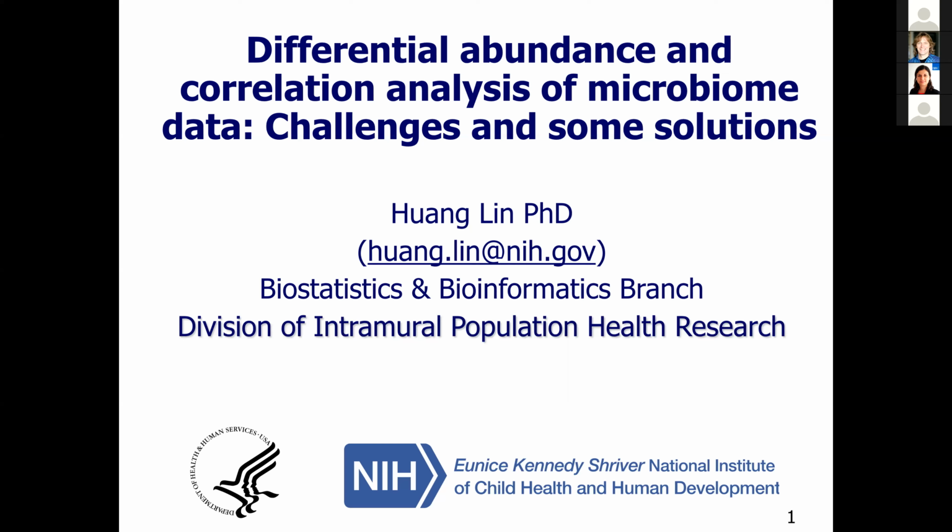So my topic today will focus on differential abundance and correlation analysis of microbiome data. Specifically, I would like to talk about the challenges of performing such analysis and some solutions we have provided so far.